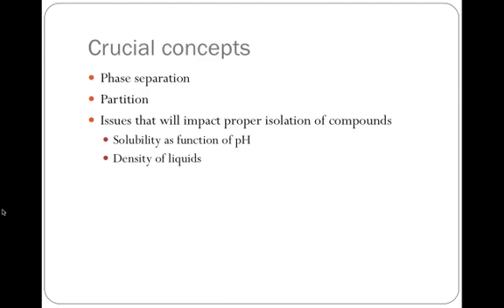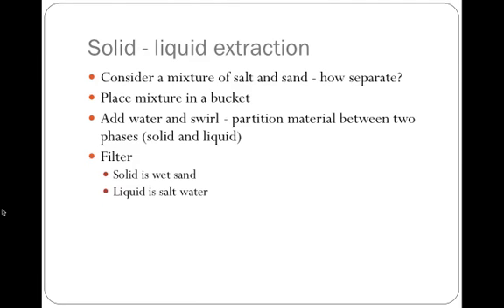The crucial concepts that play into understanding extraction are phase separation, partition, and side issues that come with that and also inform the process of extraction: an ability to understand solubility in water as a function of pH, and also the crucial role that the density of liquid plays in doing a successful separation.